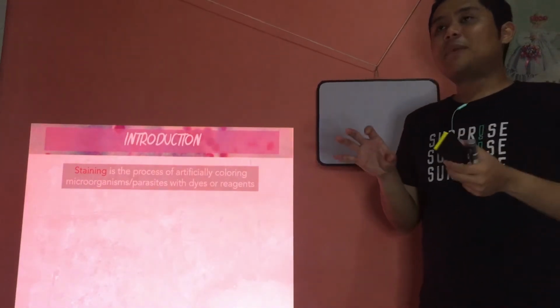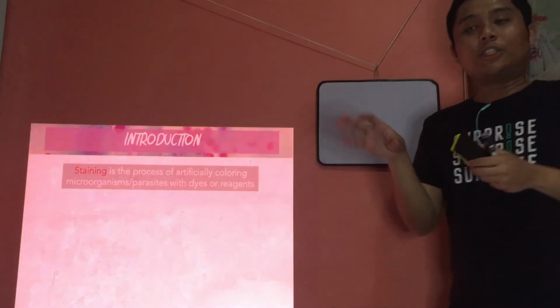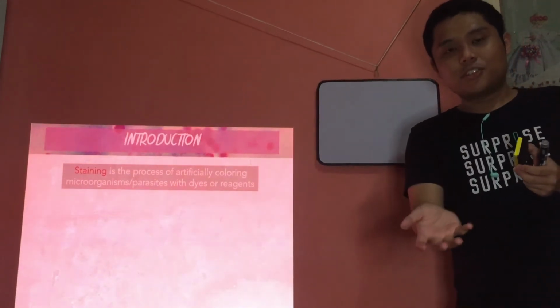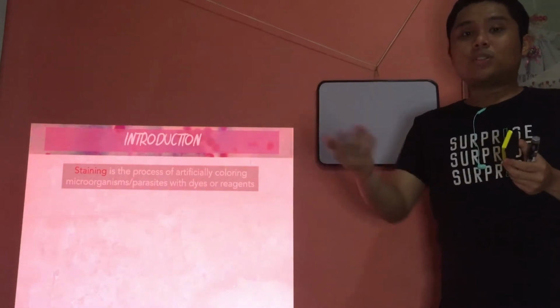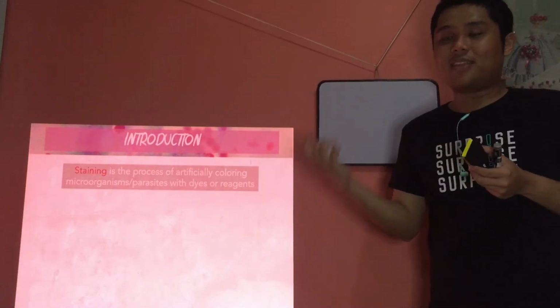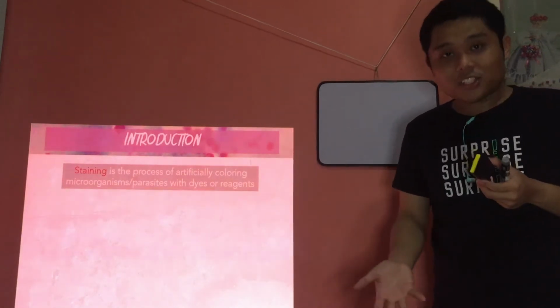Now, what do you mean by staining? Staining, by the name itself, you're artificially giving color to your organisms, may it be bacteria or parasites. But generally, similar with your culture techniques in parasitology, as I mentioned, staining is also very important, or it's part of routine diagnosis for bacteria. For parasites, staining is recommended, theoretically. Staining should be included, the preparation of permanent stain smears, right?